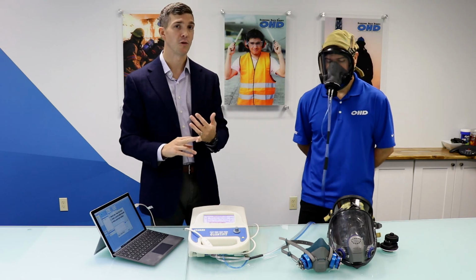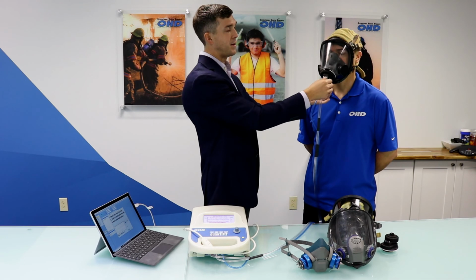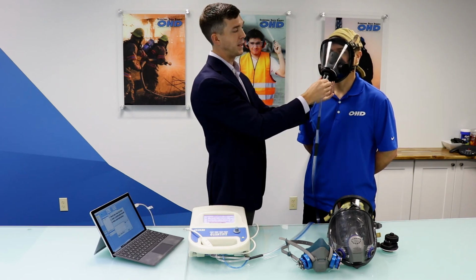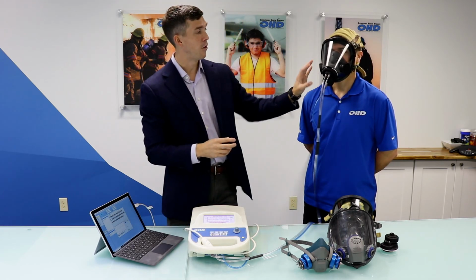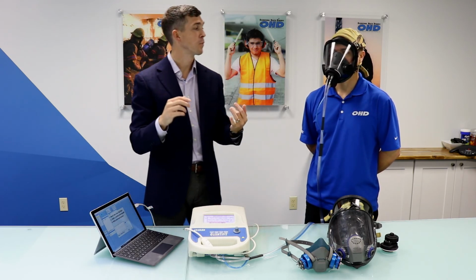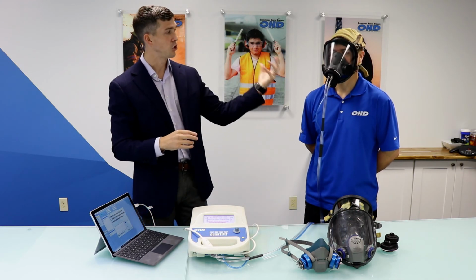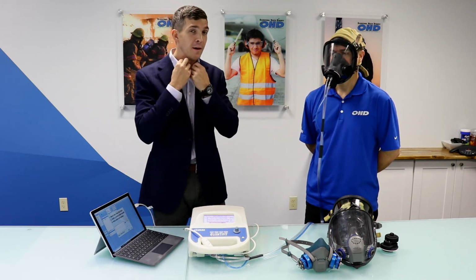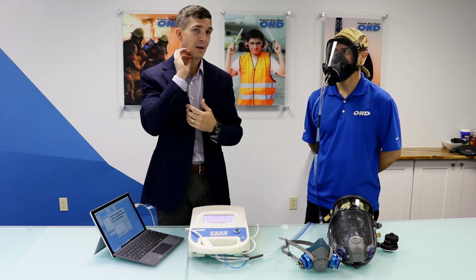If you have failures, what you want to look for first are connections. So is it not really fit related? Do I have all of my connectors properly connected in and clipped in? Is my adapter solid? Are there any issues there? The other things you want to look for, which we just talked about, facial hair, also hair from bangs or sideburns, anything like that, straps, components from the mask or respirator. We've also found clothing can be an issue, so if they've got a tall jacket on or something like that, it can get into the seal.